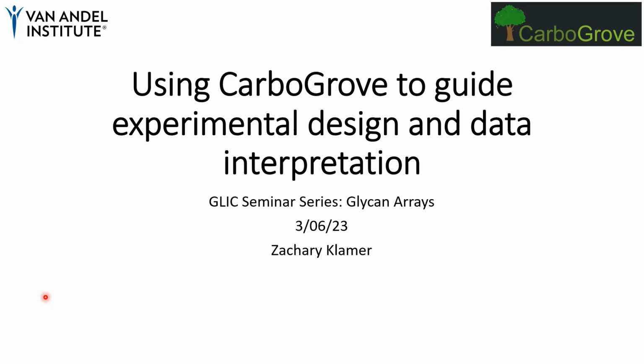But the most important thing was with these two tools that you still have to do the interpretation of the data yourself, right? These different displays help you to drill down and visualize things better and see certain things. But in the end, it's still you that has to look at the structures and then come up with conclusions saying, yeah, that is what my protein or whatever you are analyzing, that is what it's binding.